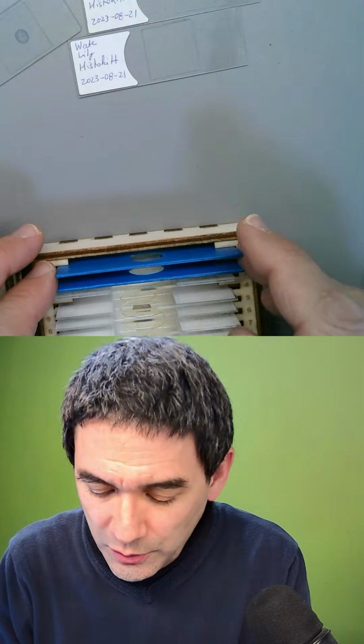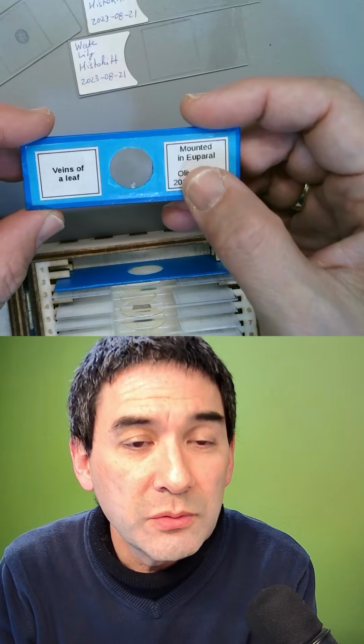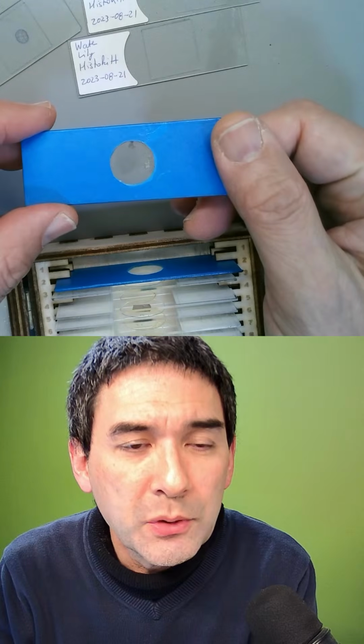Let's have a look. I want to show you first something that I tried to make several years ago, already over 10 years ago. This is a so-called paper-covered slide.